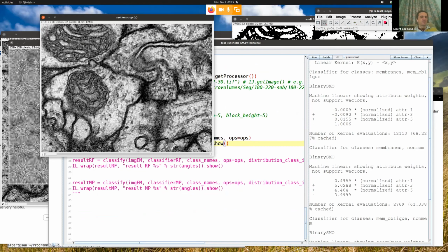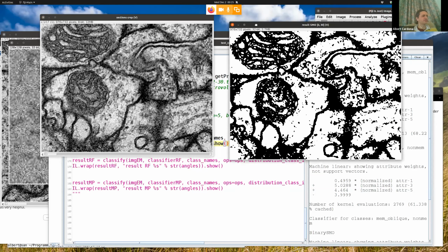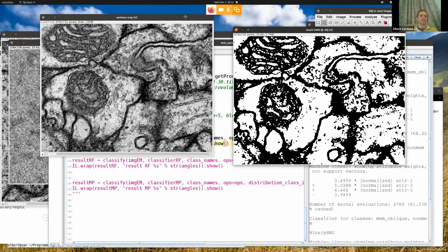So basically, in my workflow, I have this ability to represent images that are essentially collections of either 2D or 3D images that exist in the file system as a virtual image using the cell image construct with a cache, and then just visualize a fraction of it so that I can navigate through it in a very easy way without ever having to load the whole data set, which would be essentially impossible. And then for some of these, I go and create, say, segmentations or brightness and contrast adjustments or fast Fourier transforms to check the focus of the image and so on, to check whether the microscope needs adjusting.